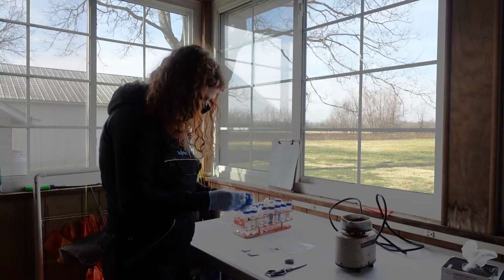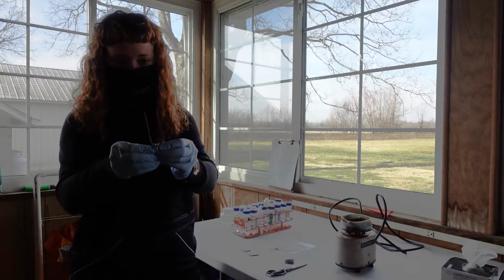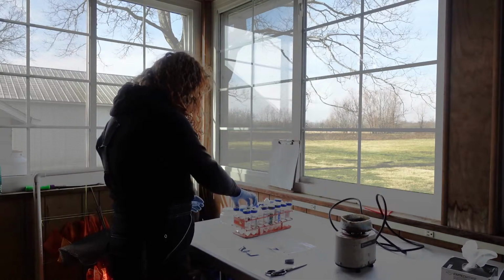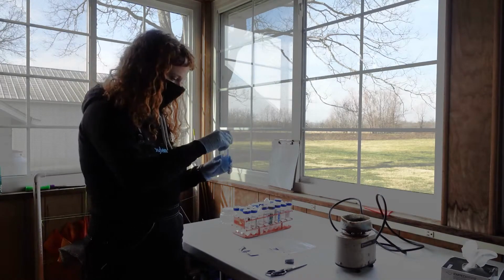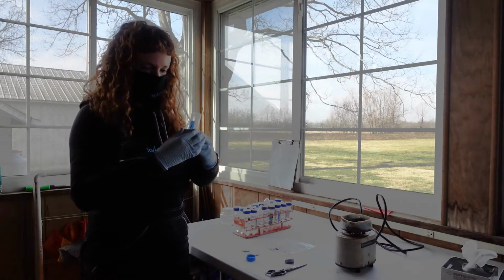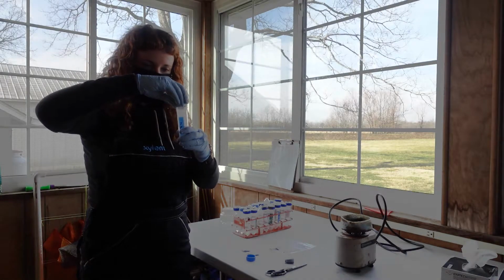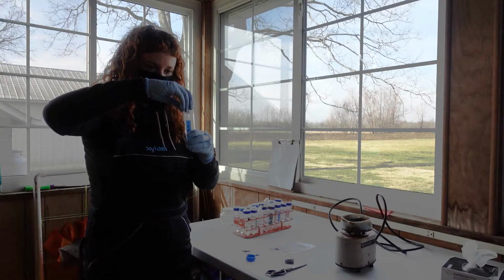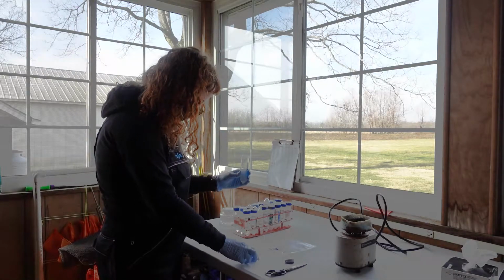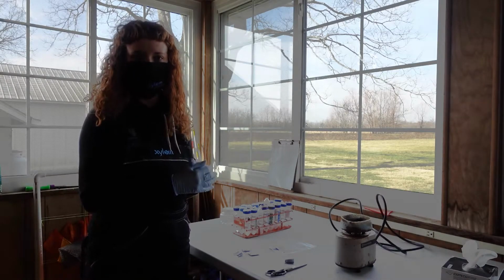So inside these pouches there's a powder reagent. And what we'll do is we'll pinch this open, makes it easier to pour. All right, and then I'll take my sample from the last step, take my reagent and pour it in. And I want to try to get as much of that powder as I can in here, so sometimes you might flick the pouch a little bit. Once you've got everything in there, replace the cap and set aside, and you'll fill up to 4 samples at a time.